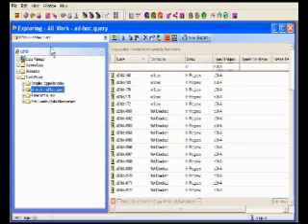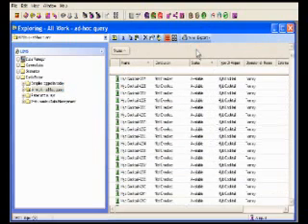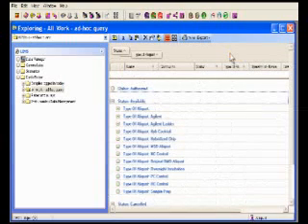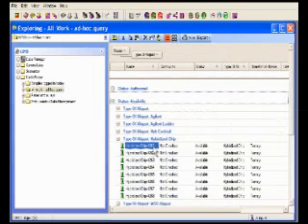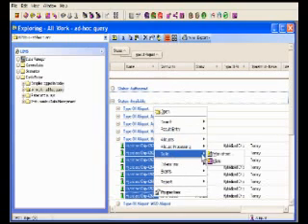Nautilus' work environment empowers users to locate and analyze data by simple actions such as drag and drop. Acting on a truly relational database, the personalized workspace allows users to organize, search, query, and collaborate on their work.